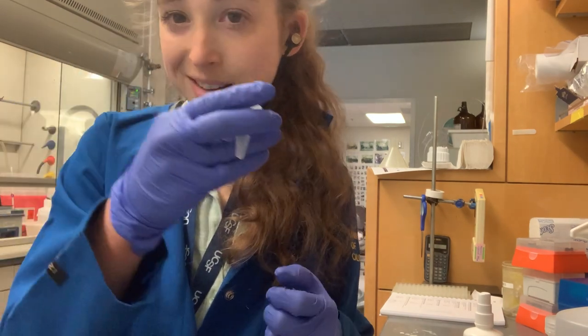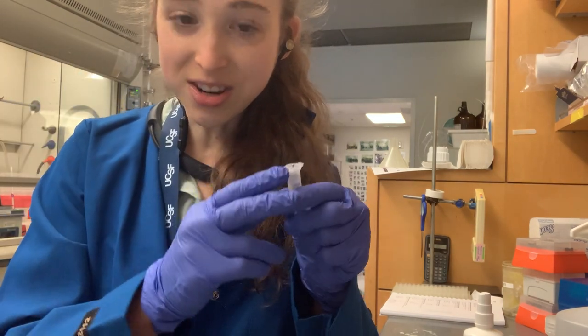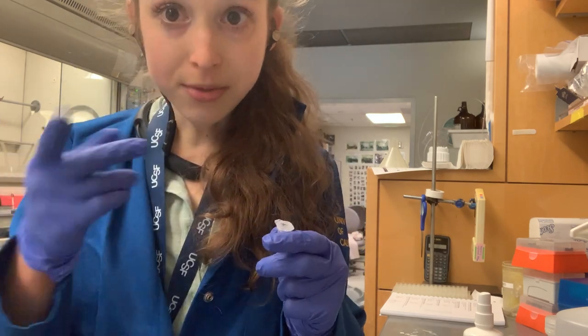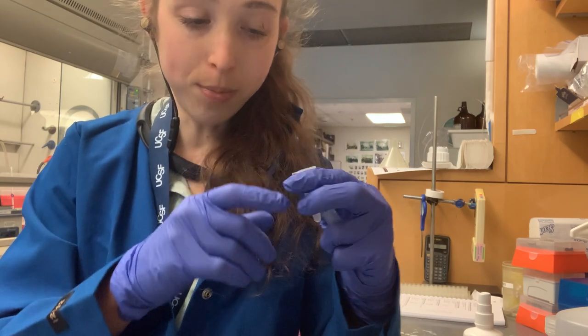It's really helpful when the lids are attached. If the lid is on, then it's okay. But what if the lid breaks off? This can happen in your centrifuge if you're doing a spin where you have to run it open.